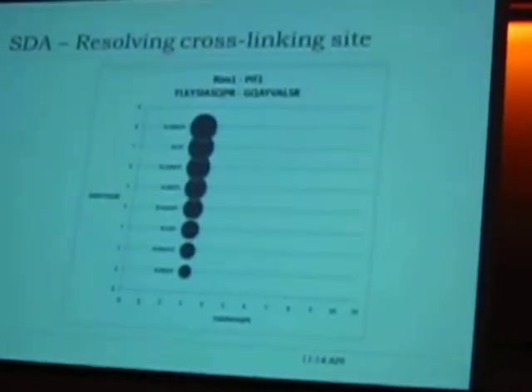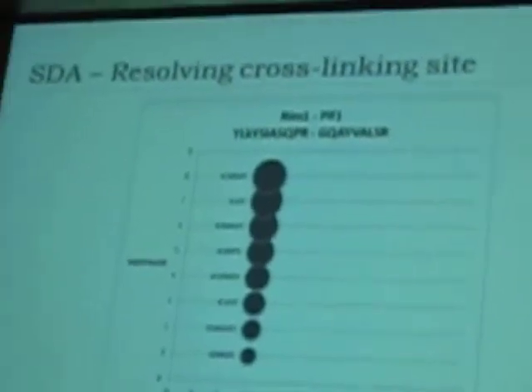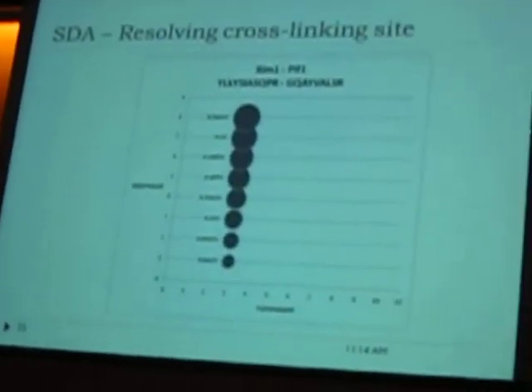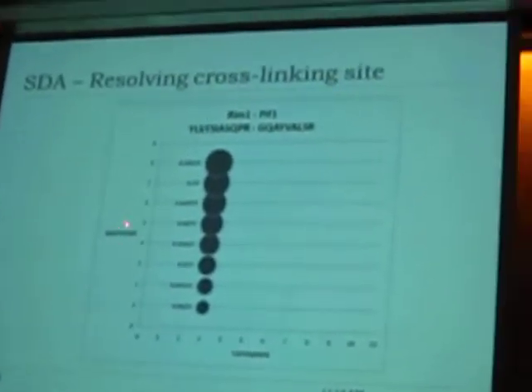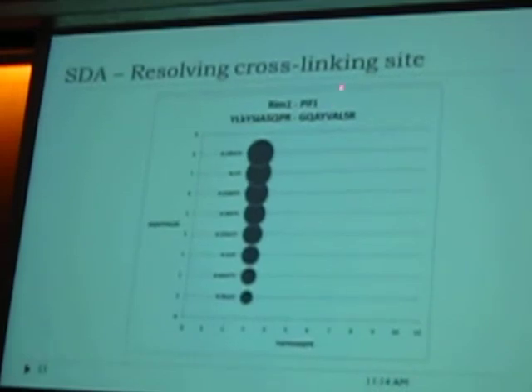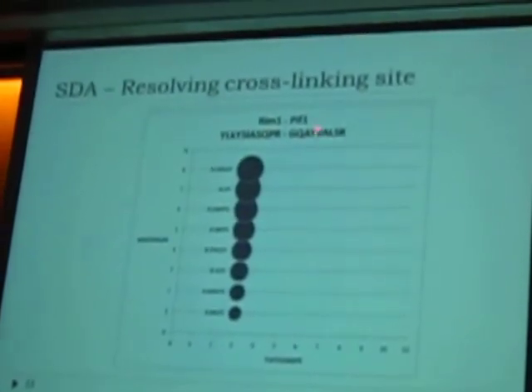If you see the same thing for resolving when we have non-specificity, this is what we would ideally like to see, because when it comes to the spectrum, we are considering B and Y and so on, so there is a difference of only 2 peaks, and we really like to see this increment in the score to be certain that this peptide is probably interacting via the C-terminal and not any other part of the N.